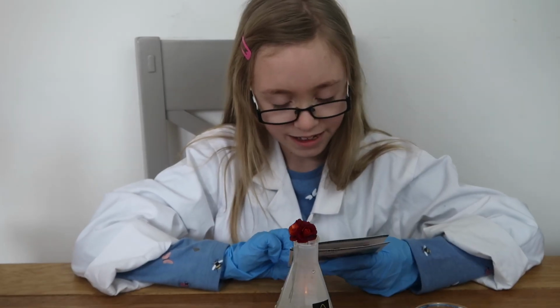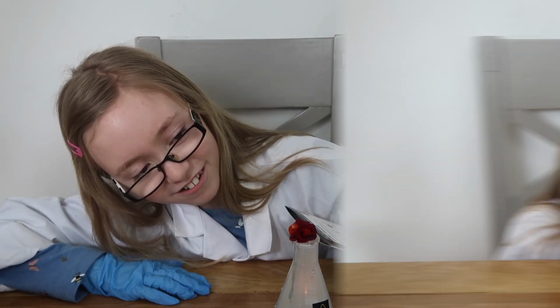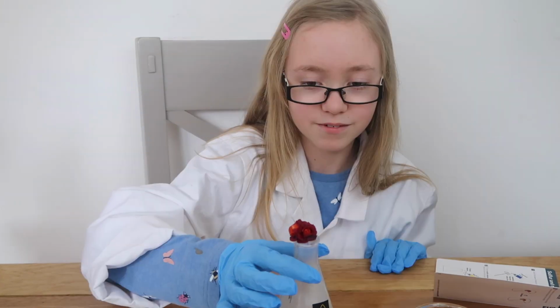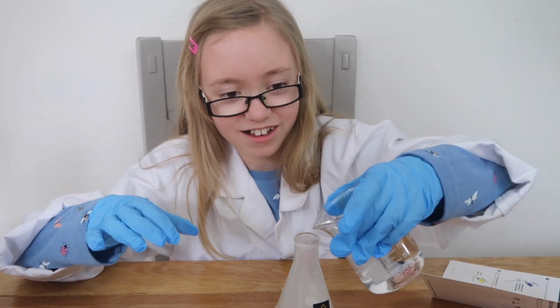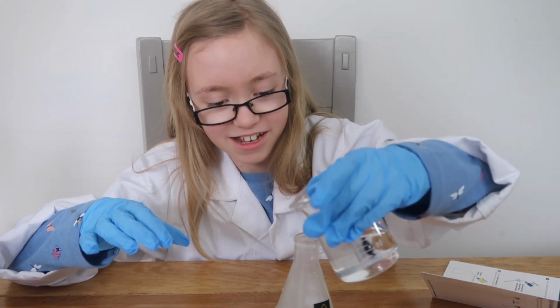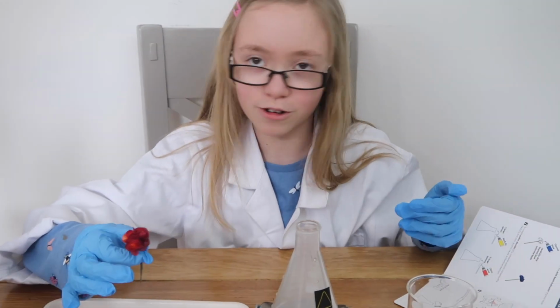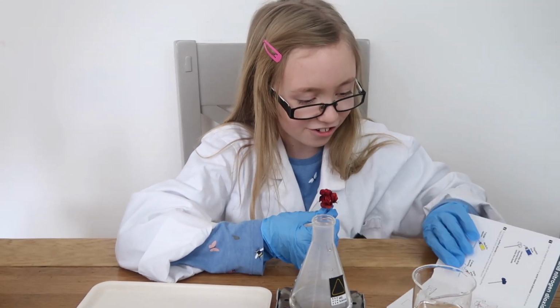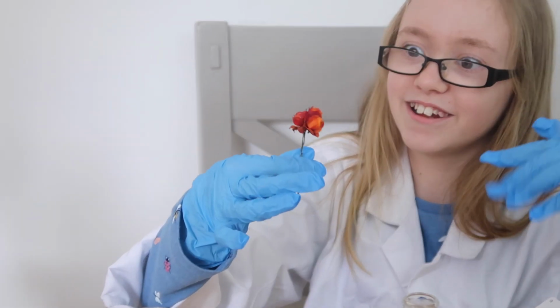When it has exposure to air, it should turn orange. It should turn orange again. Steam. We've made steam. Let's take the little flower out and add water to this flask to prevent any chemical reaction whatsoever that might blow up my house. Hopefully when we leave this out for a bit, it should turn gradually orange again. You can see it is turning orange.